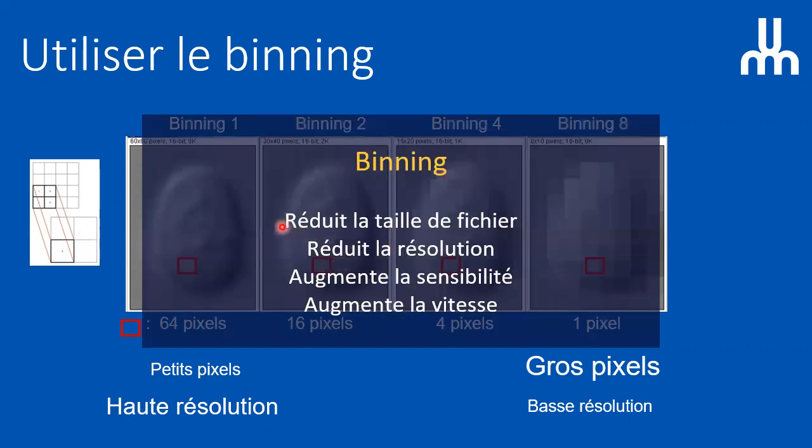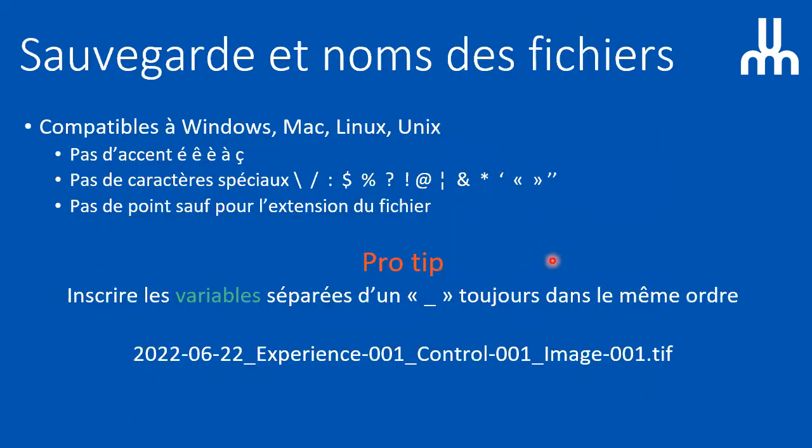If you do binning, it's going to reduce the size of your file. It's going to reduce the resolution, but it's increasing the sensitivity and also the speed. So knowing binning and using it when you need to is actually a good thing.